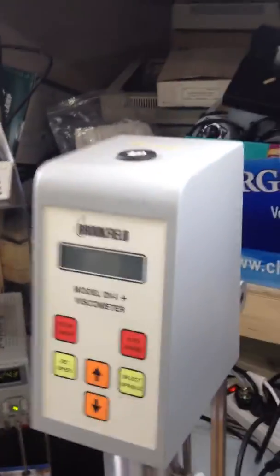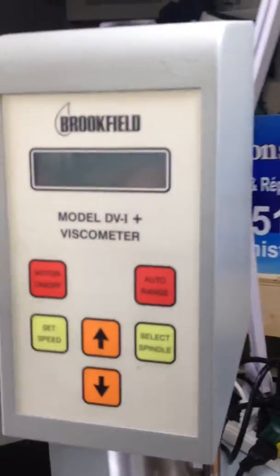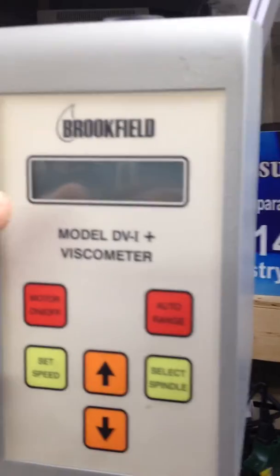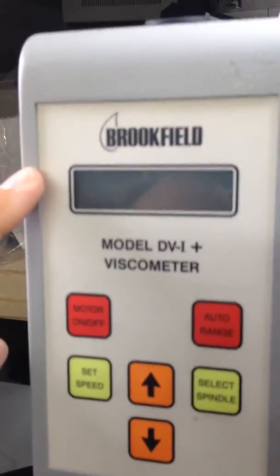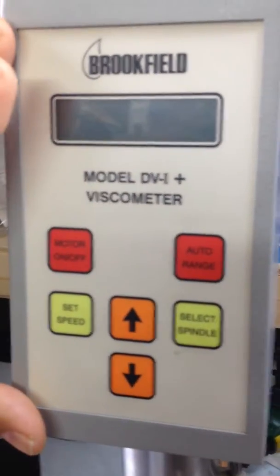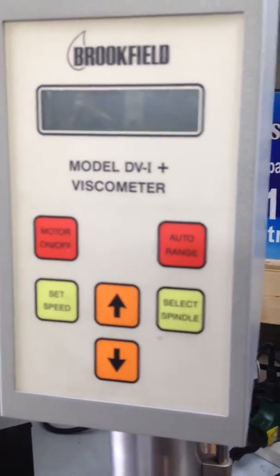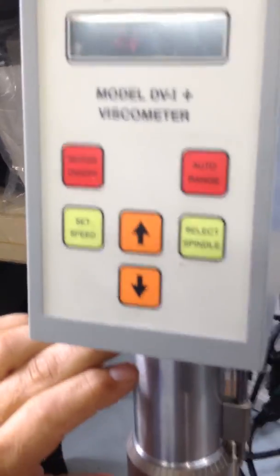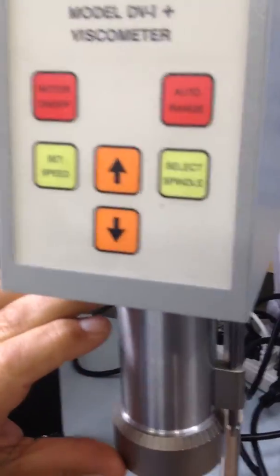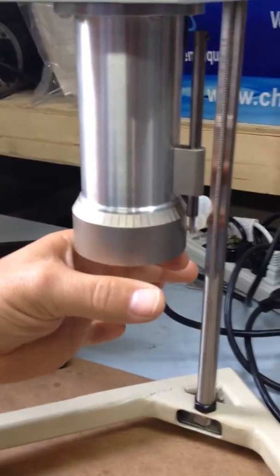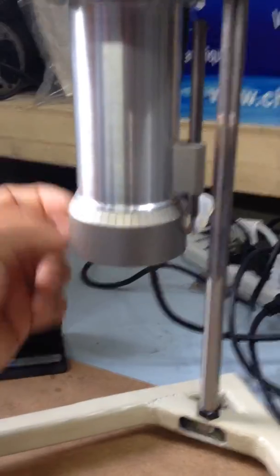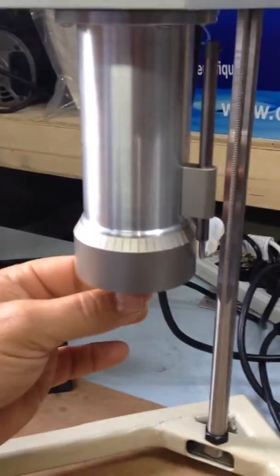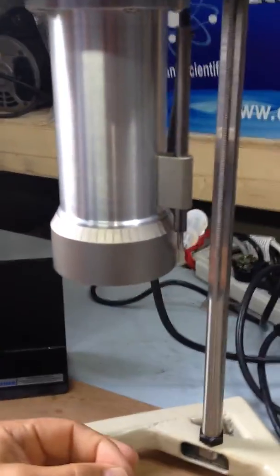This is the model DV1 plus viscometer Brookfield and this is the setup you will have. Right now it's powered off and the setup that we have now is for the cone. If you have an internal system to circulate a cone, the same system can be used if you put a spindle on it.